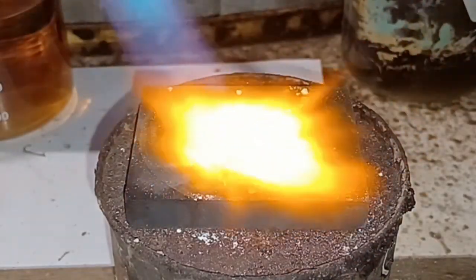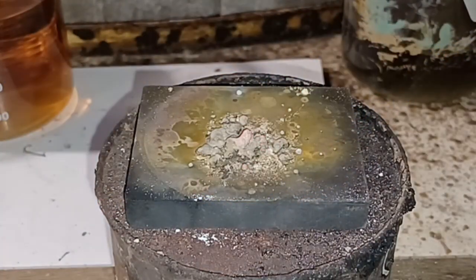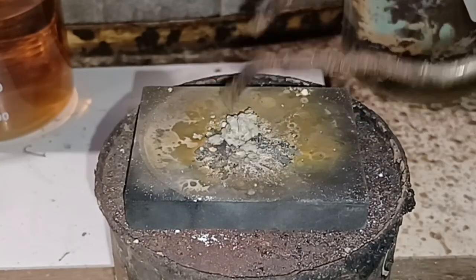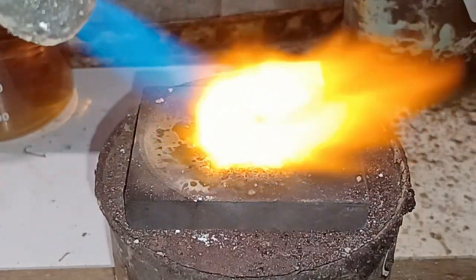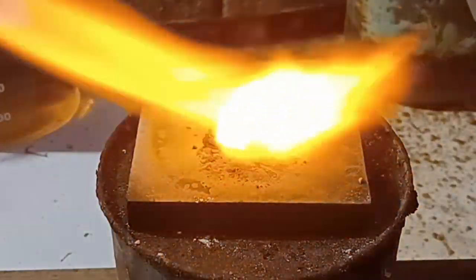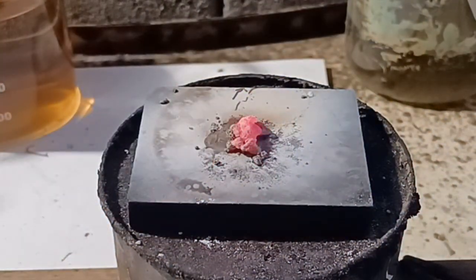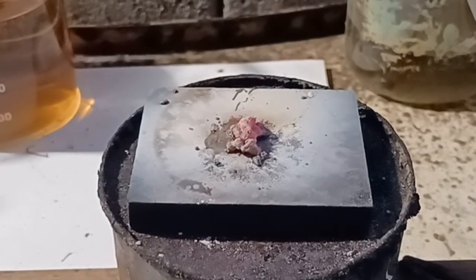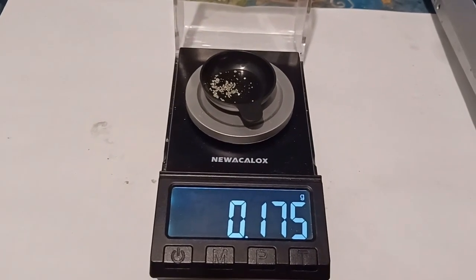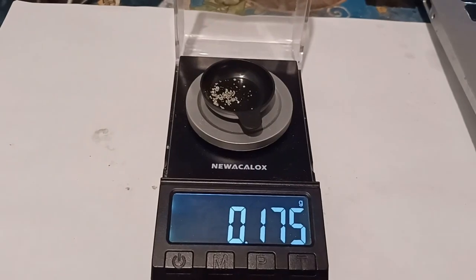An added benefit of using a graphite plate is that I am able to prove that silver is vaporizing, because some of the vapor condensed on its surface. This melting with sodium carbonate yielded me 175 milligrams of silver. It seems that no matter the method, I am vaporizing most of the metal.